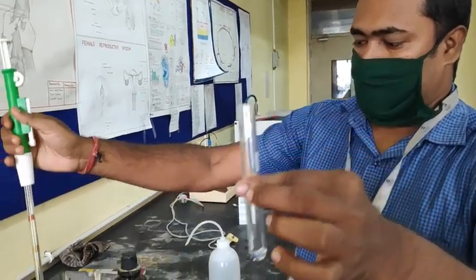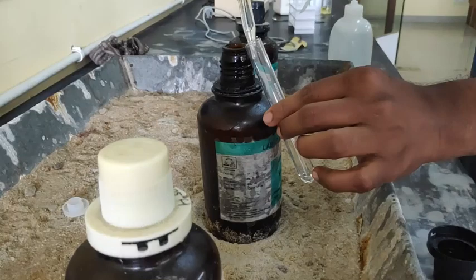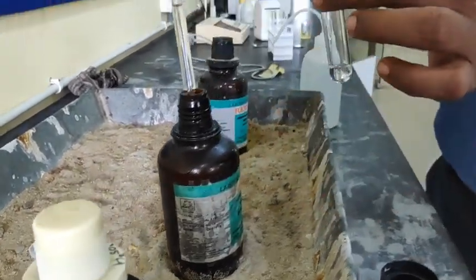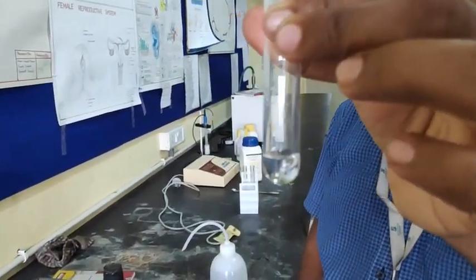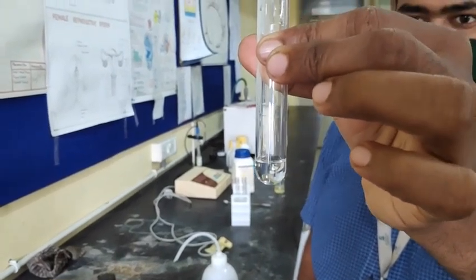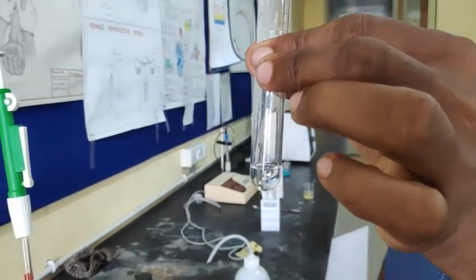This same test we are doing with a blank. By blank we mean that there is no sample present, so that is plain and simple water, and he has added some nitric acid to the water. As we can see, there is no precipitation formed. So this is one test with which we can confirmably say whether a protein is present or not.